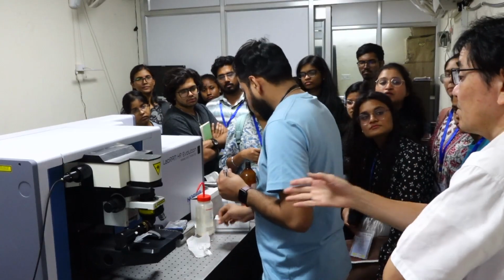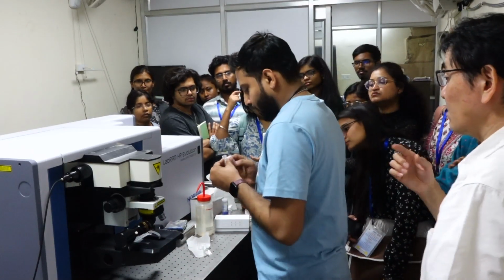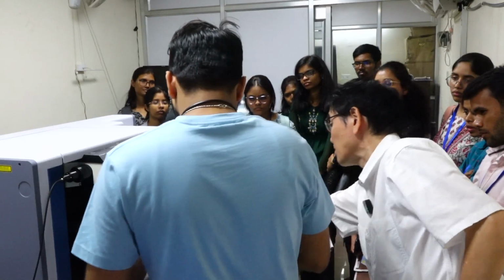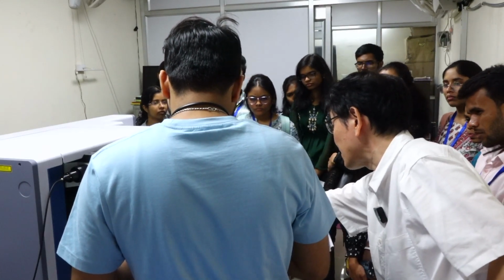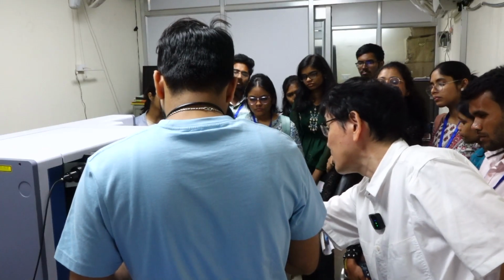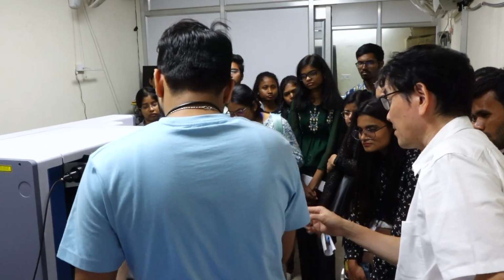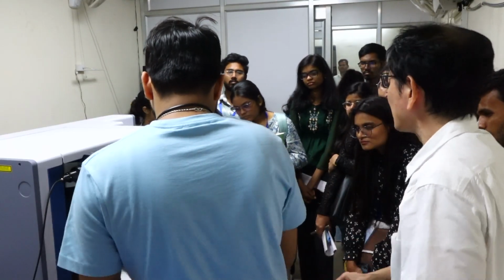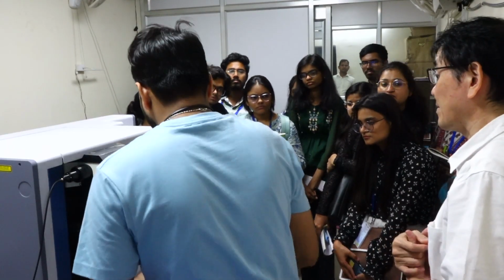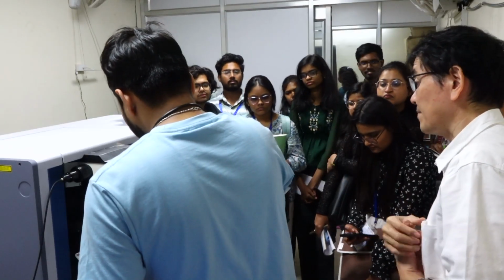So now the new attachment is put here. Instead of the microscope objective, it focuses and transfers the light onto this cuvette. So this is a typical Raman measurement, not a Raman microscope. And we can put a sample here.